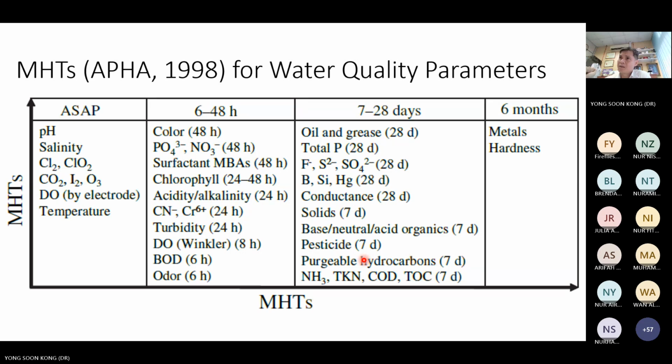Sulfuric acid. Sulfuric acid is not correct because sulfuric acid is for ammonia. Nitric acid. Yep. So remember, acid, so many types. Heavy metal, nitric acid. Ammonia, sulfuric acid.